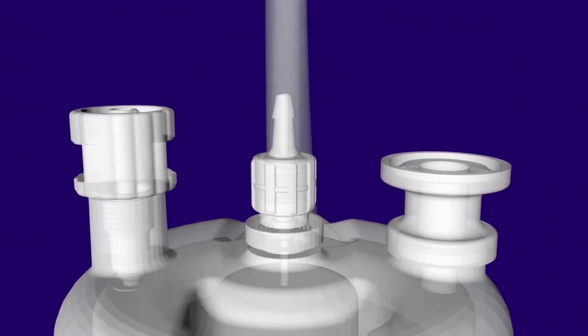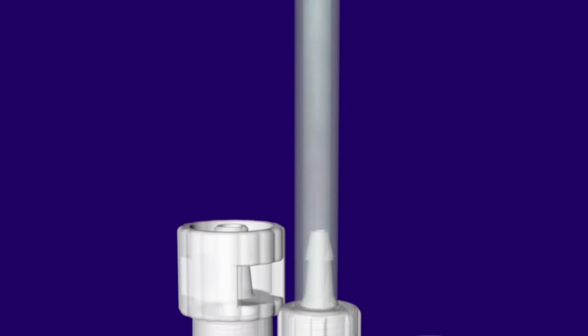Gas, perhaps compressed air or nitrogen, flows through the sterilizing membrane at low pressure directly into the inner space of the filter cartridge where most of the hold-up volume is trapped.